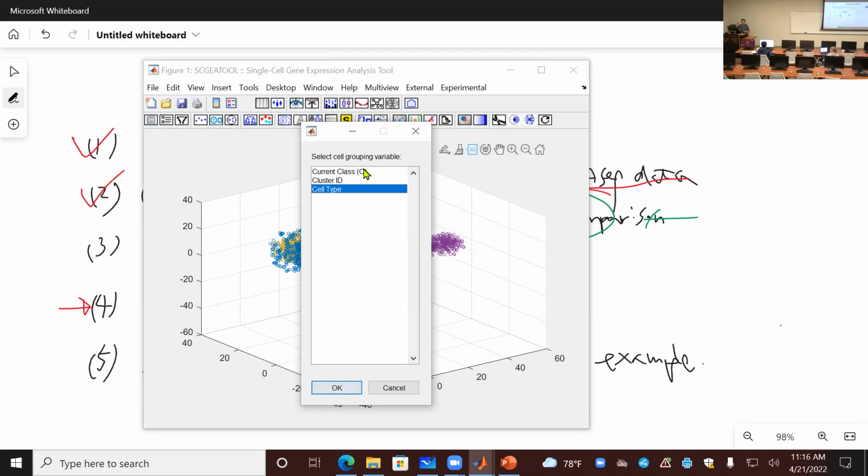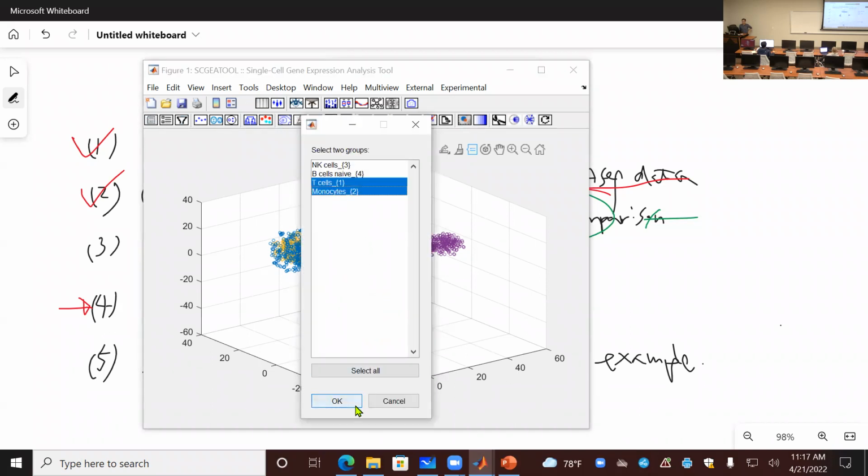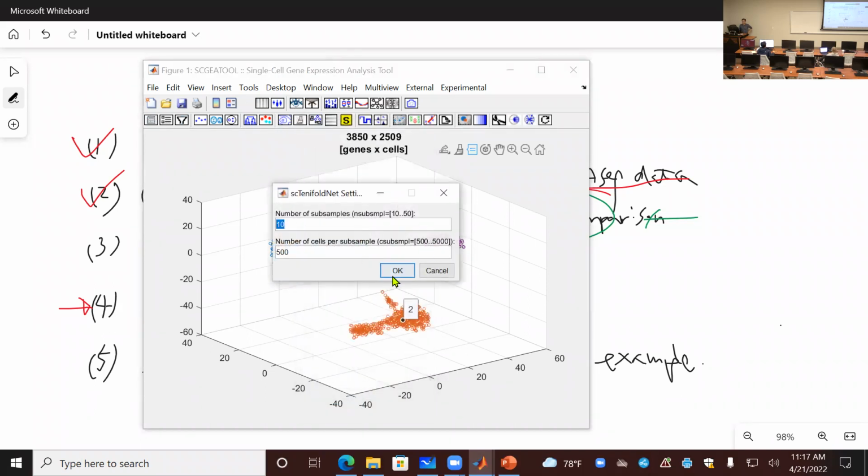In this case, you will have options. I want to have a batch ID compare. And your basic cell population is T cell, so you don't care about the cell type. You just compare these two clear populations, but only differed by their condition. Then you create a network independently for these two data sets, two batches of cells, and then align them and find the most different part. Okay, and if you do this way, you will have the parameters.